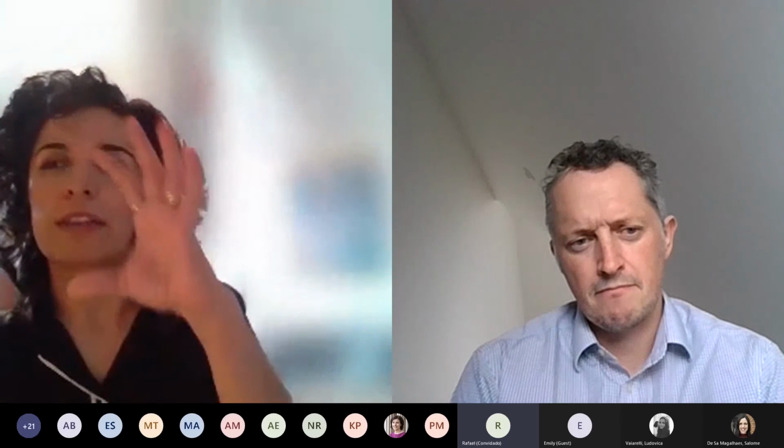With some of these more advanced techniques, there will always be more parameters that can be adjusted, right? The simpler the technique, the fewer parameters. But here we've got quite a lot of parameters, although we're looking at a 2-dimensional image, and in that sense it's pretty straightforward when the image analysis takes place, because we're not working with fluorescence, and we're not doing any additional labeling. We're adding the samples onto a grid, we get a 2-dimensional image, and then we're basically tracing the space around it. So in some ways there is some simplicity there that benefits us.